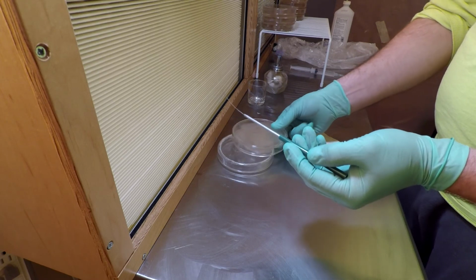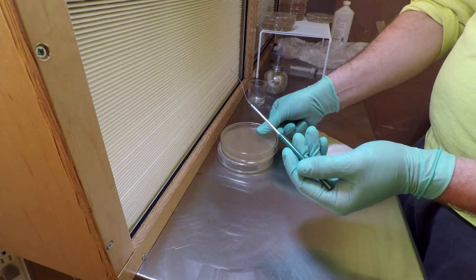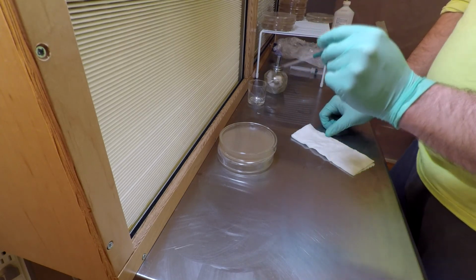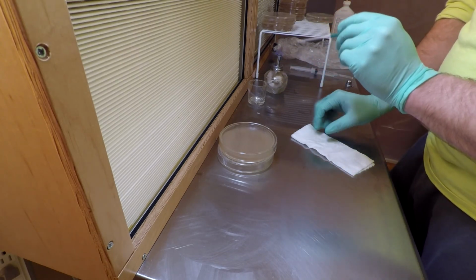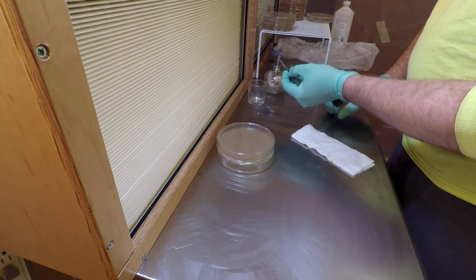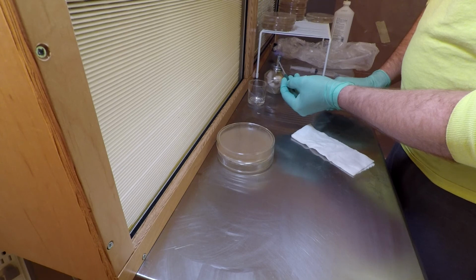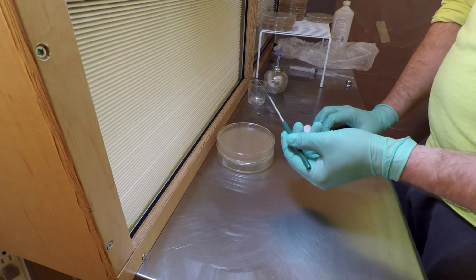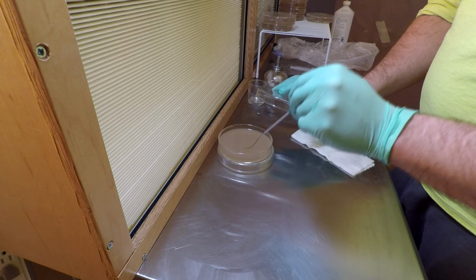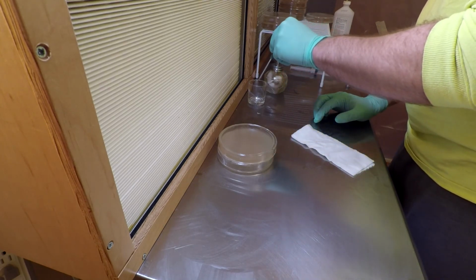If this were a spore print, it would be the same procedure of heating the loop, letting it cool off in the air or in the agar, and then touching the loop to the spore print. No dragging it through the print, no trying to get more spores on it. All you gotta do is touch it, and it'll be enough to grab the right amount of spores. And when you make your own spore syringes, the classic method is actually using an inoculation loop to grab a small amount of spores they can still visibly see on the loop from a spore print, and then dipping that into a shot glass of sterilized water and swirling it around and sucking it back up into a syringe.